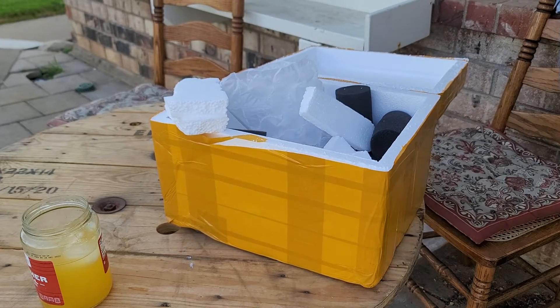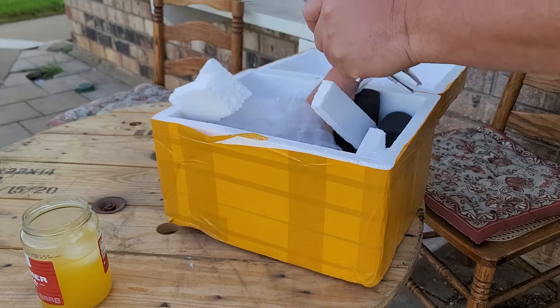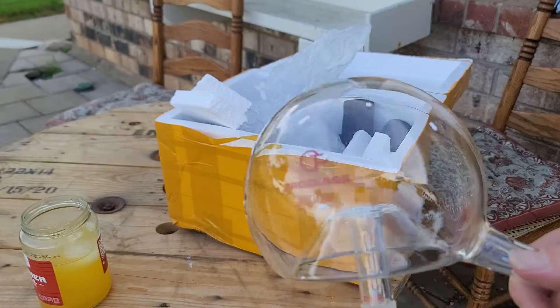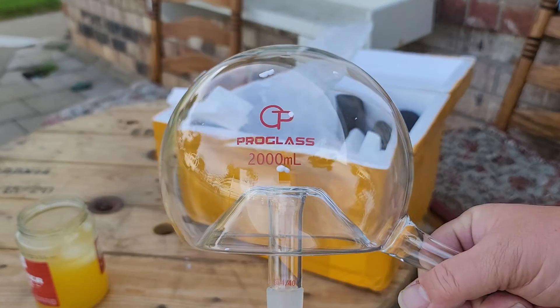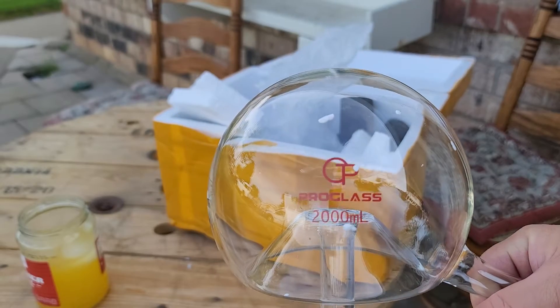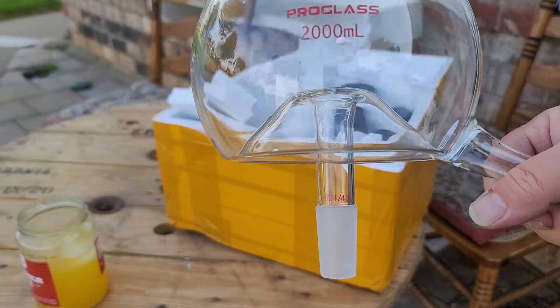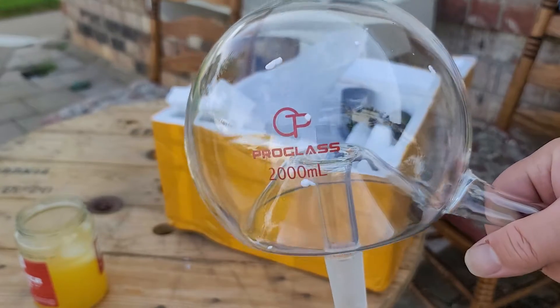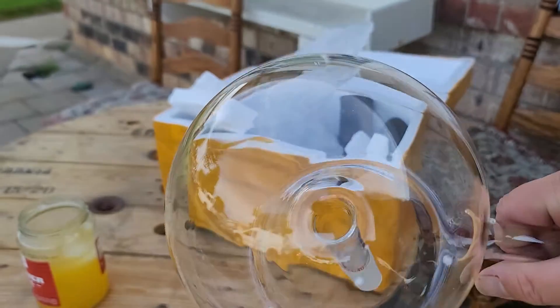Oh! Guess what, people? Look at that. 2,000 ml. 24/40 joint. It's got the drip rail inside — a nice, well-defined drip rail.